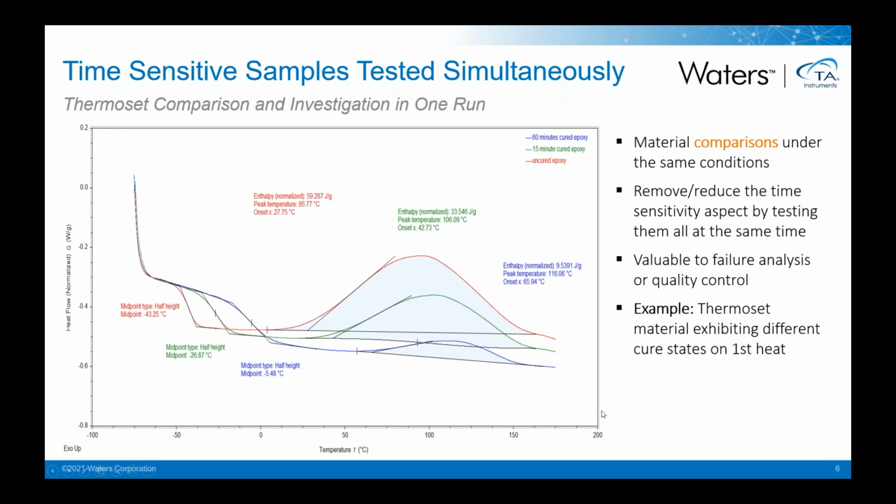There's some amount of time that reaction is taking place. Regardless of how well it's mixed, you're going to have some reaction.